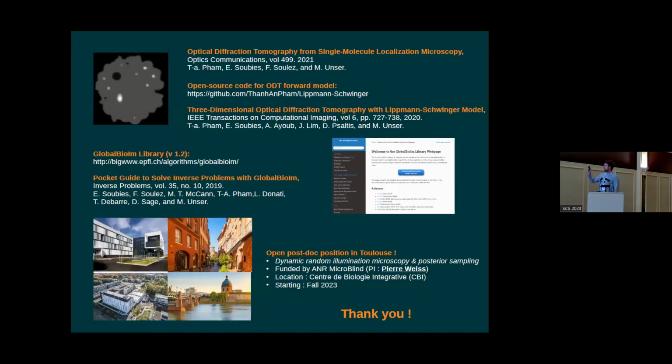So to conclude, here at the top you have the main paper related to this work, and the third line here corresponds to where we describe this computation of the forward model. Everything has been implemented using the Global BioIm library.